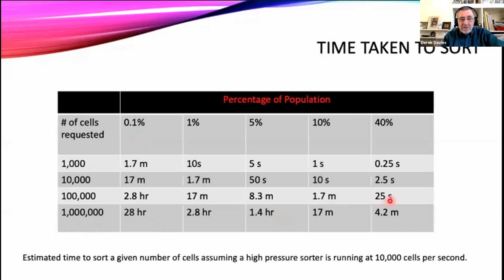So knowing something about the biological question and the target frequency is going to be important in helping you decide how long you want to book the machine. Now, in this case, we would work with you to do some sort of pre-enrichment or book half a dozen cytometers to get that done much more quickly. And of course, even if you say, I've got 10 samples that I want to sort, we're not going to be able to do that in an hour or 2 hours or even 3 hours, because remember, we have to factor in time for cleaning in between. So all these practical considerations are quite important when you're thinking about actually turning up in the flow lab.